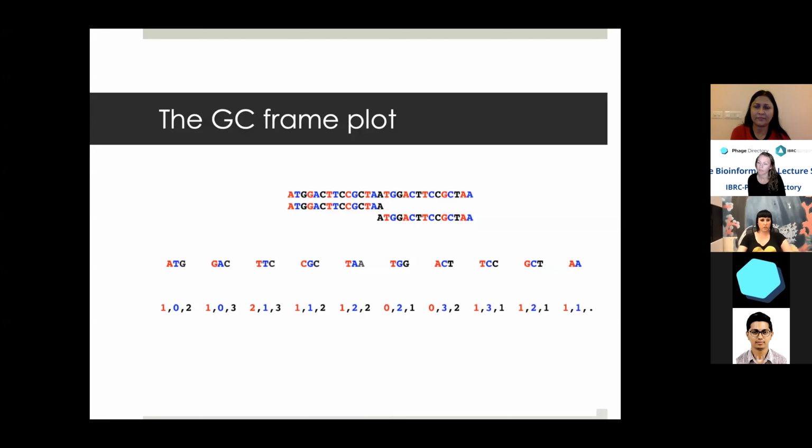And so you always want to post-automated annotation. After running the automated step, go through and visually inspect the genome yourself and figure out whether or not it looks right. Oddly enough, it's something that I had just learned to do myself, and when talking to other labs, they've come to the same conclusion.